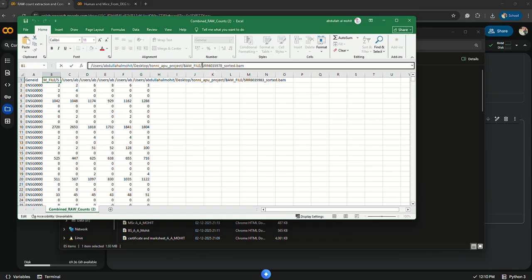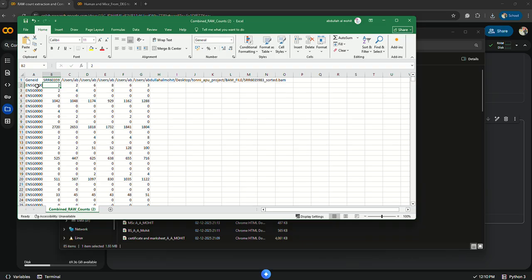So simply we can just remove this from here, and yeah, this is fine. And you can see another thing, this is 78, this should be 79. Yes, 79, this 80, 81, 82, and 83.